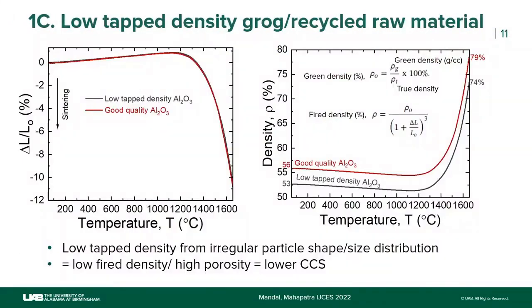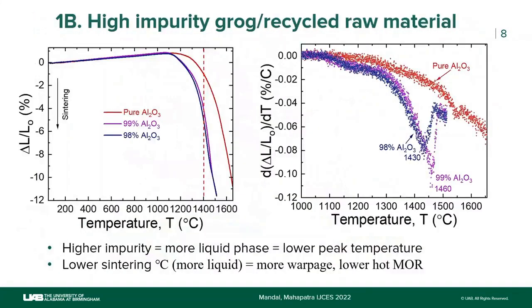You're not expecting all the raw materials coming in to have the same chemistry, right? So normally what happens is that if you buy a suspicious raw material, there is batch to batch variation. Say one bag of a ton is different from another bag. So the best case scenario would be to test from each bag, just as you do in a normal test.